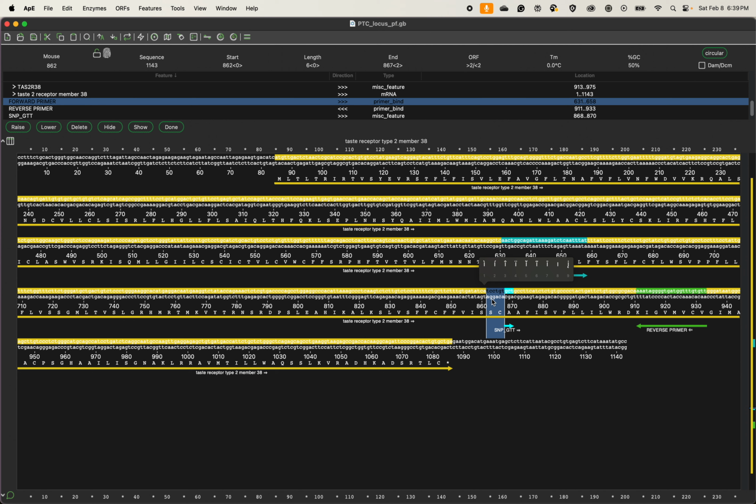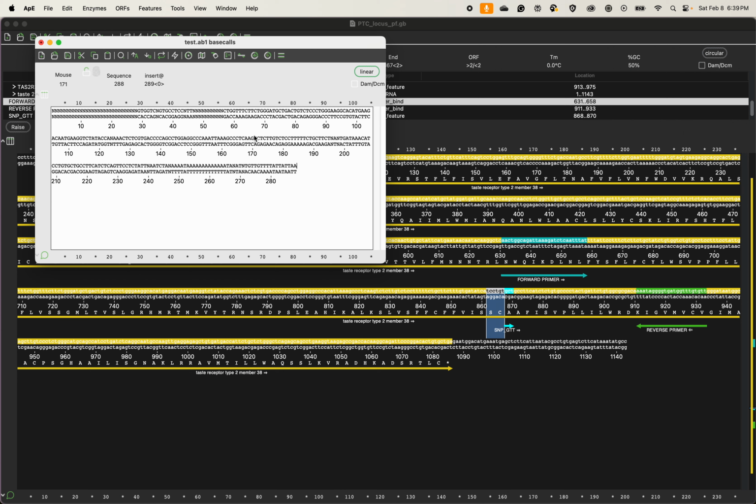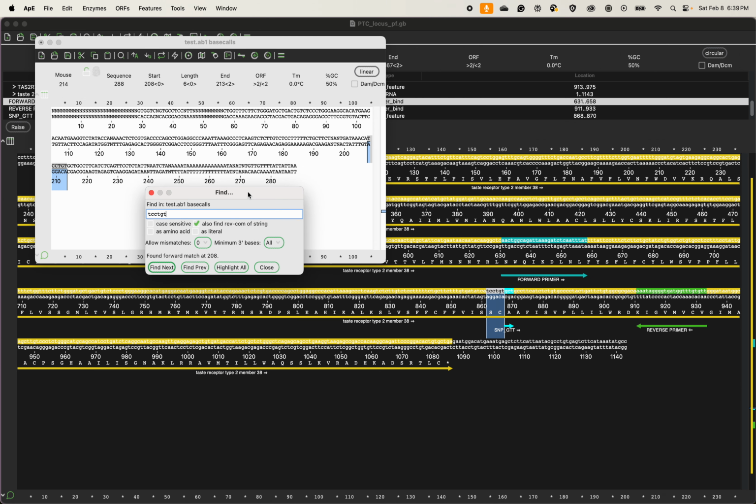Okay, let's see if we can copy. Control C. My right click is not working. I don't know if this actually copied. APE gives me problems sometimes. Now let's see if we can search here, this little magnifying glass. Paste. Okay, find next. I actually found something. We're in business.